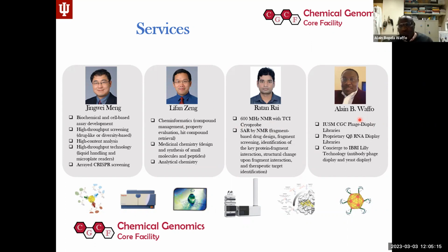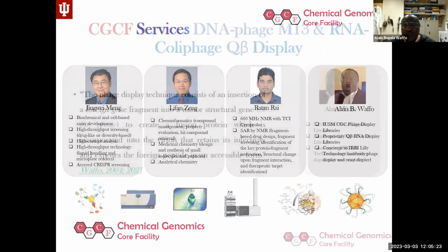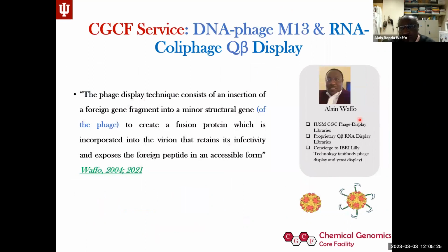But before anything, I know some people may have heard this for the first time. I really want to go as detailed as possible so you have an idea of what phage display is. Let us start with the definition. Phage is just small viruses infecting only bacteria, but we use it for technology.